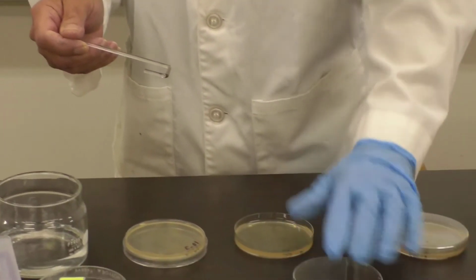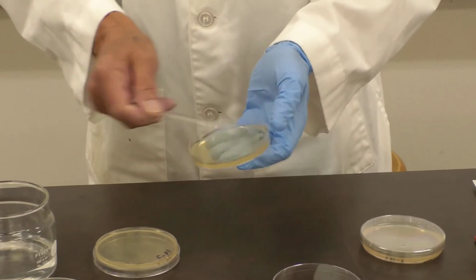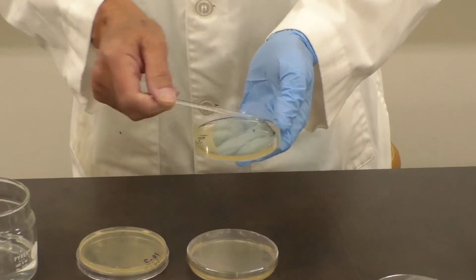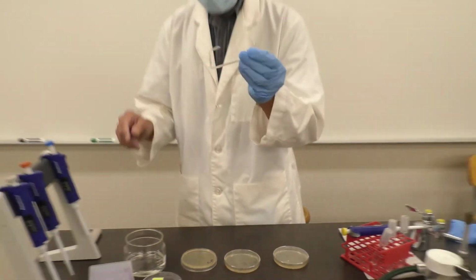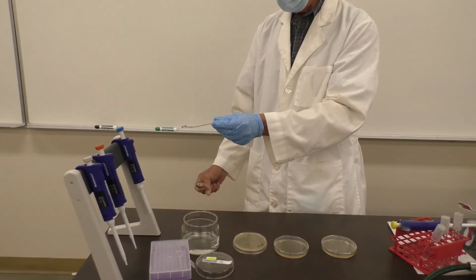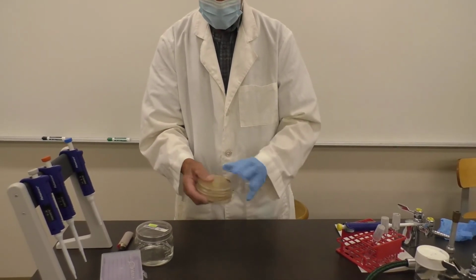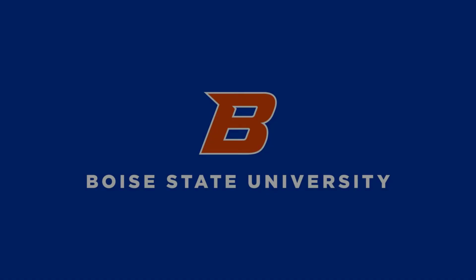Most dilute. Next. And our last plate. You notice how I'm using my fingers to rotate the plate to spread that 100 microliters uniformly. Okay, contaminated hockey stick, sterilize it again, let the alcohol burn off. Now your three plates are ready for incubation.